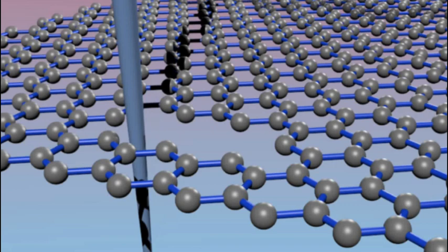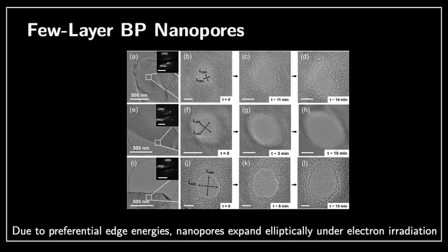This is a picture from the group of Maria Derndic at UPenn. So these were the experimentalists who worked on this while we did the theory. What they did, they created those pores, so they actually bombarded phosphorene, starting from phosphorene in figure A. And then the idea there was to start to create a pore.